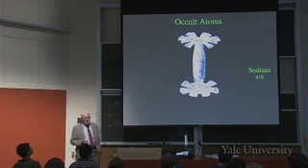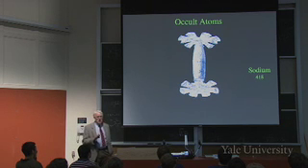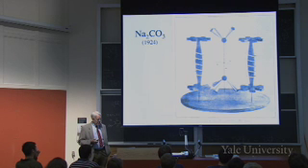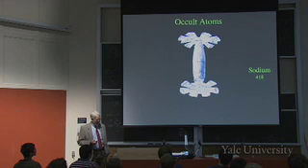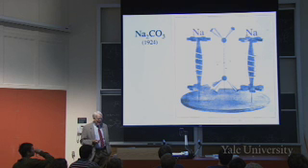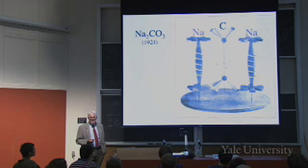Okay, there's sodium, 418. They not only said they saw atoms, they also saw molecules. For example, here is sodium carbonate. What do you see in there? Right? 2 sodiums. Okay. In the back are pieces of a carbon atom. What else do you see?